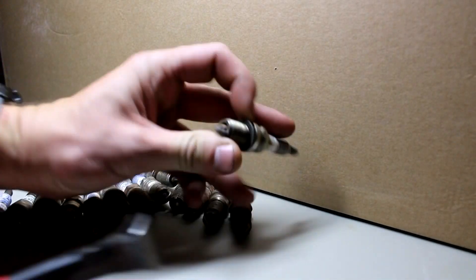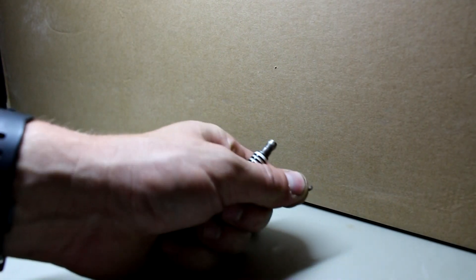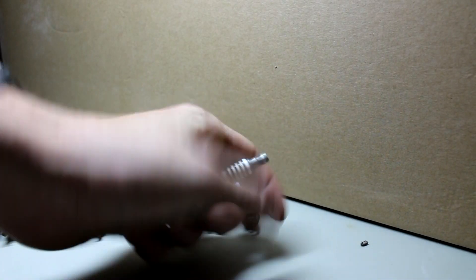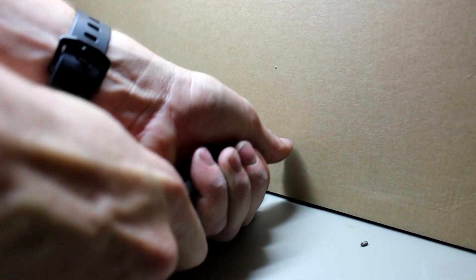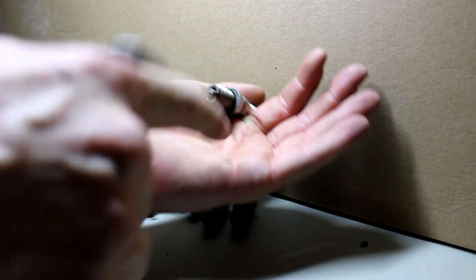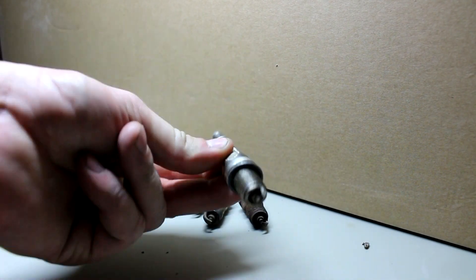To get the platinum out of these I'm going to start by cutting off this little tip here. This actually contains a little spot of platinum on it as well, so I will be keeping that. And also this other contact down in here — I'll be keeping that as well. Those are the parts that are going to contain the platinum. The rest of this is really just steel and ceramic.